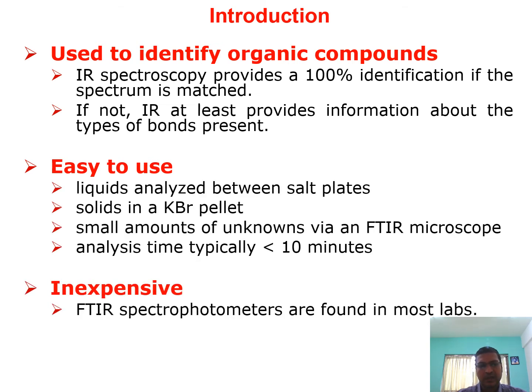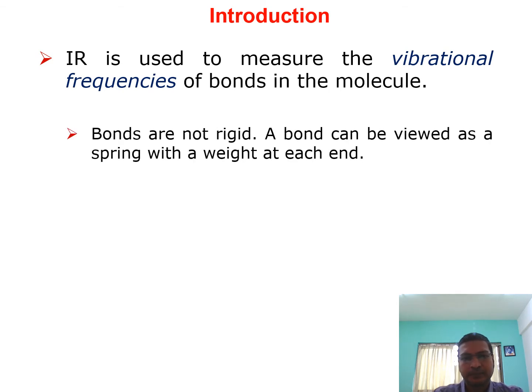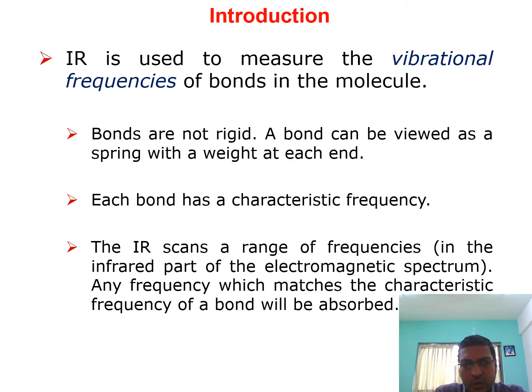Next one. What is done in infrared spectroscopy? It is used to measure the vibrational frequency of the bonds in the molecule.